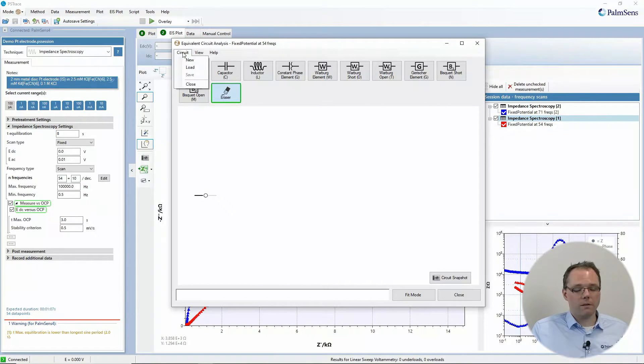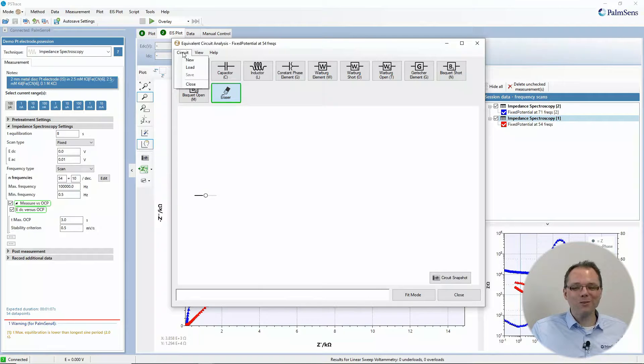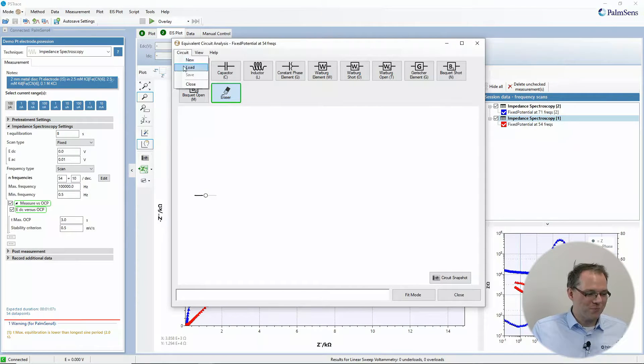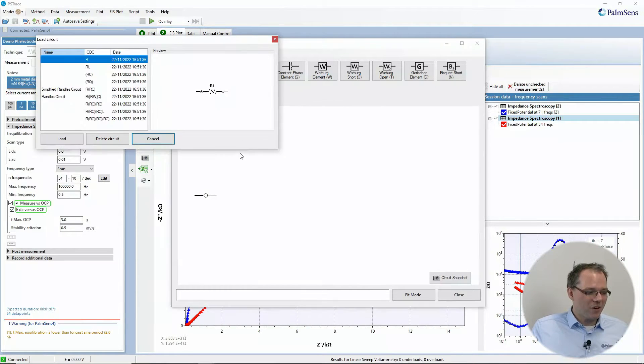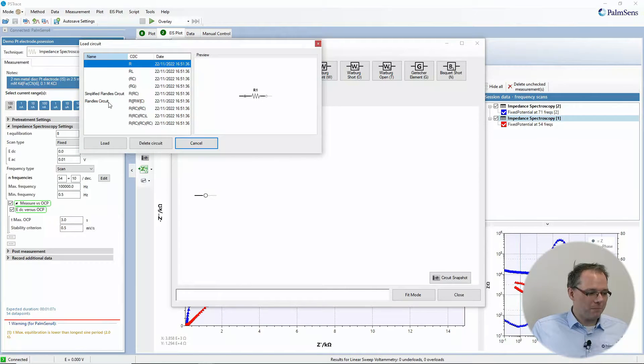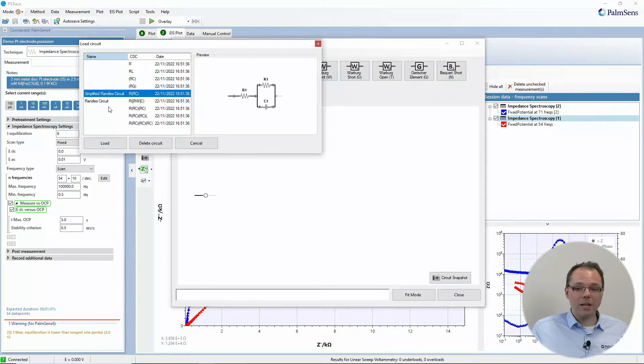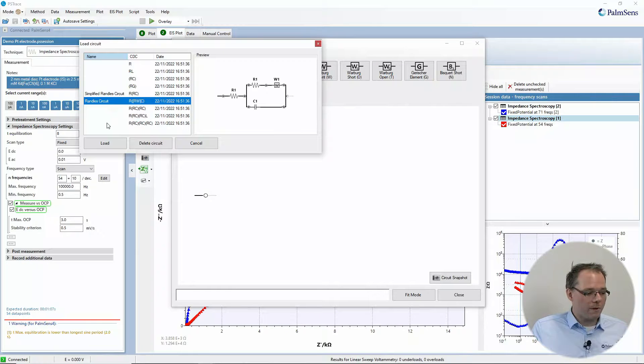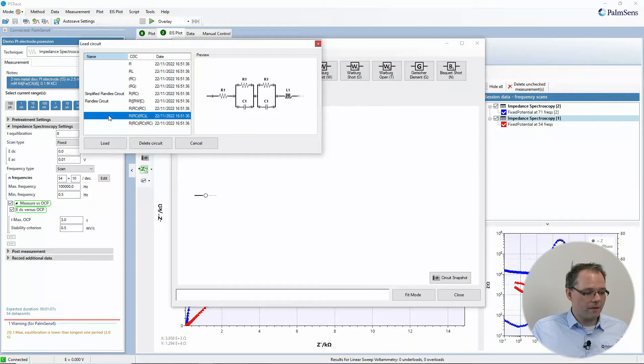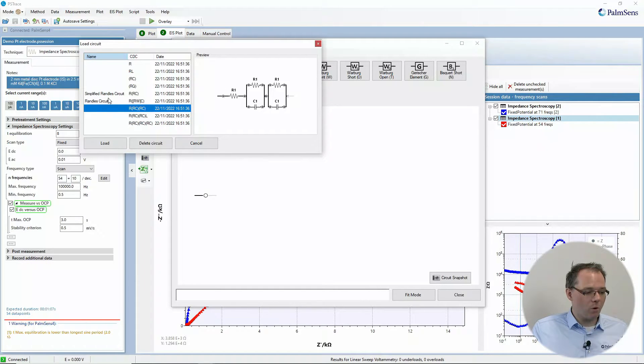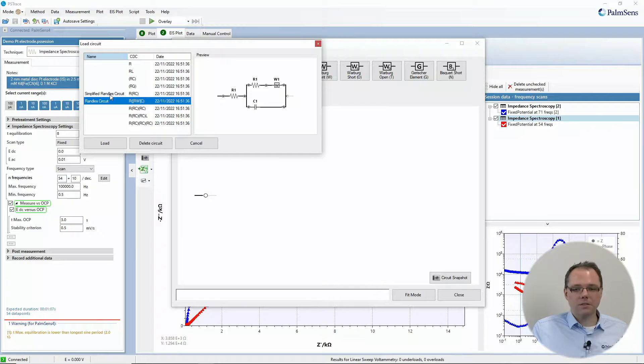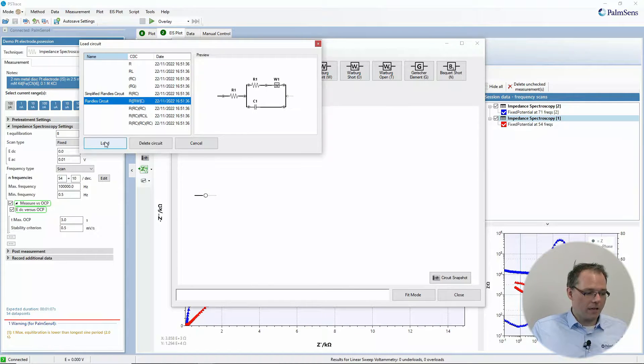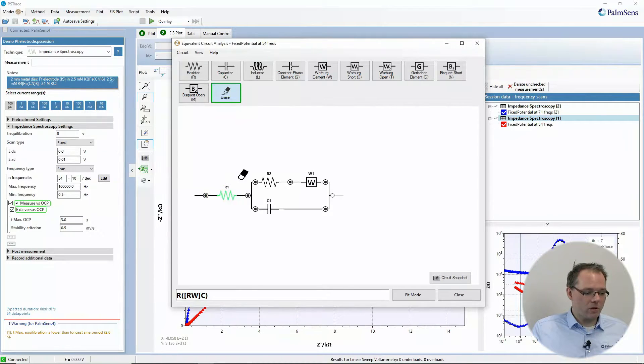You can also load some circuits that we have pre-made for you. So you can load for example the very popular simplified Randles circuit, or also the regular Randles circuit, or some other circuits that are more common in different fields like corrosion or batteries. Maybe let's just load the Randles circuit.